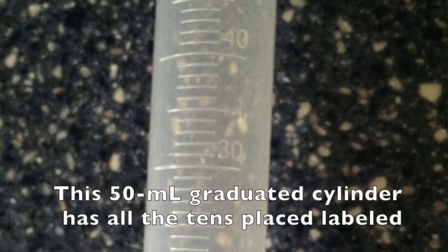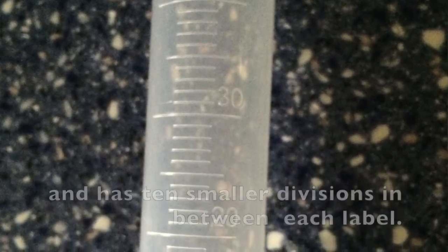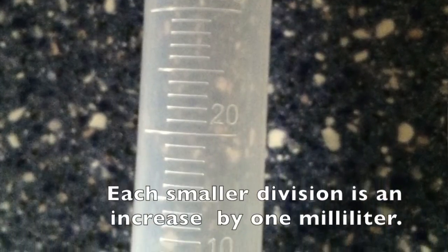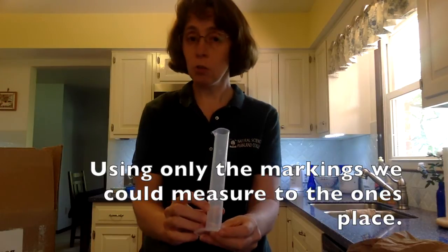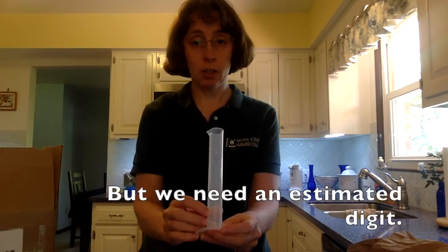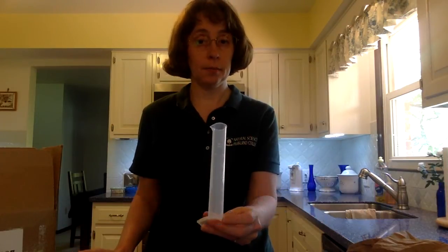This 50 milliliter graduated cylinder has all the tens places labeled and has 10 smaller divisions in between each label. Each smaller division is an increase by 1 milliliter. Using only the markings, we could measure to the ones place. But we need an estimated digit. Our estimated digit will be the first decimal place.